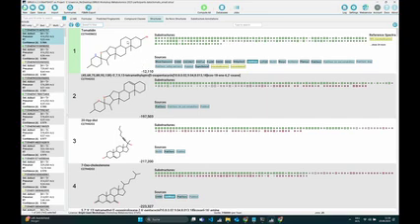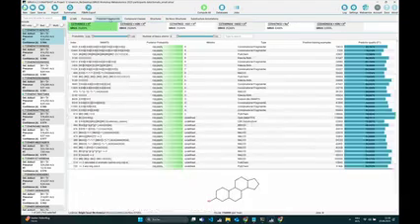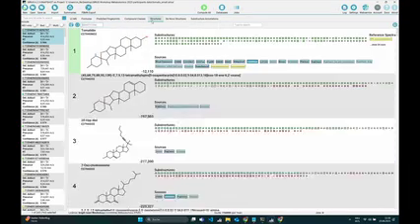And what you can see here, you get the name of the compound that is our best hit, its molecular formula. You get the structure of this, and now you also get all these green dots, which are all the substructures which we have predicted. So all the ones that we have predicted in the predicted fingerprint tab, and that are also contained in this structure hit. And it also tells us whether these substructures fit or not.